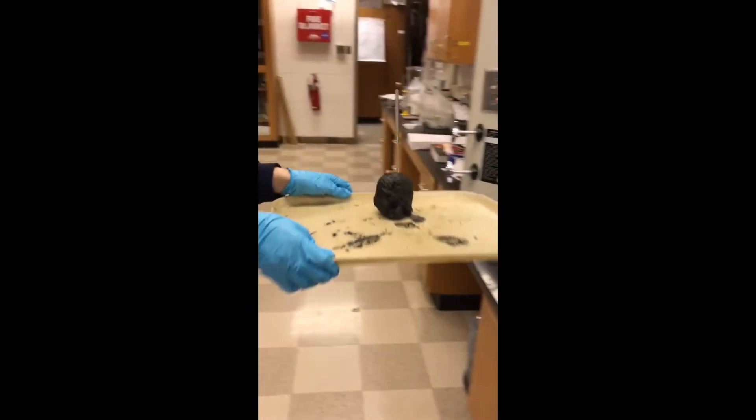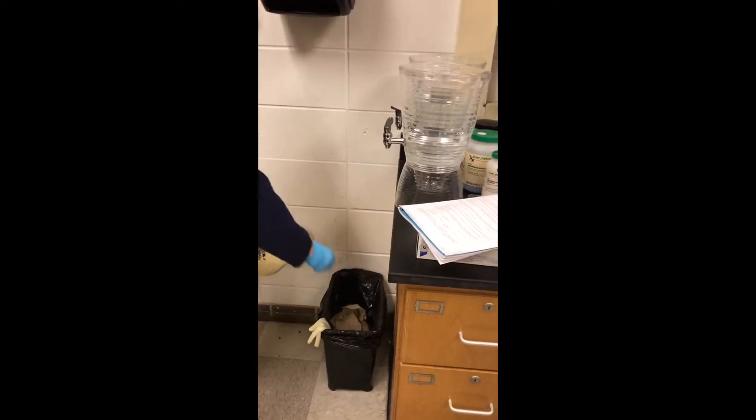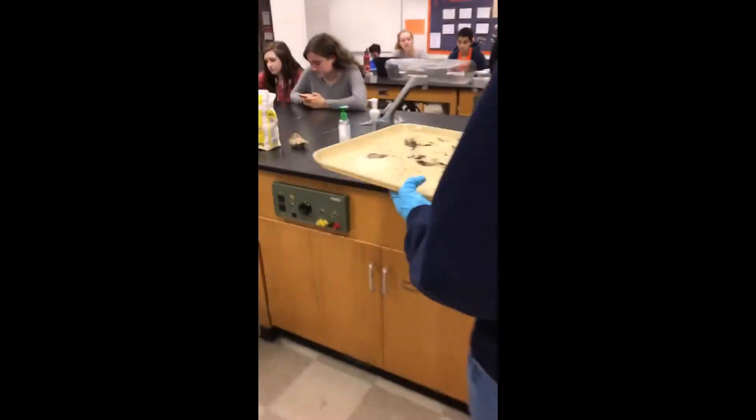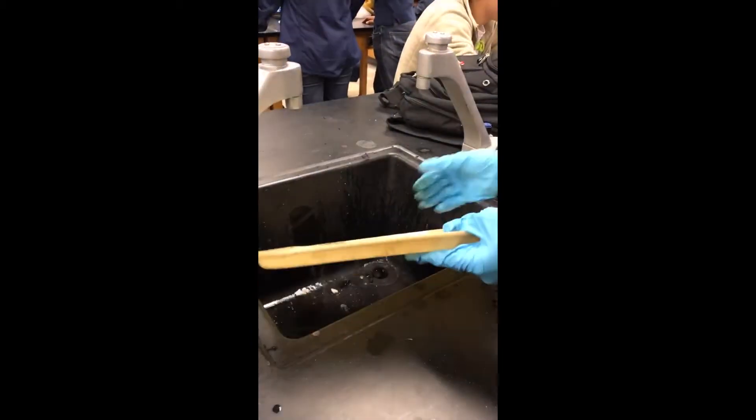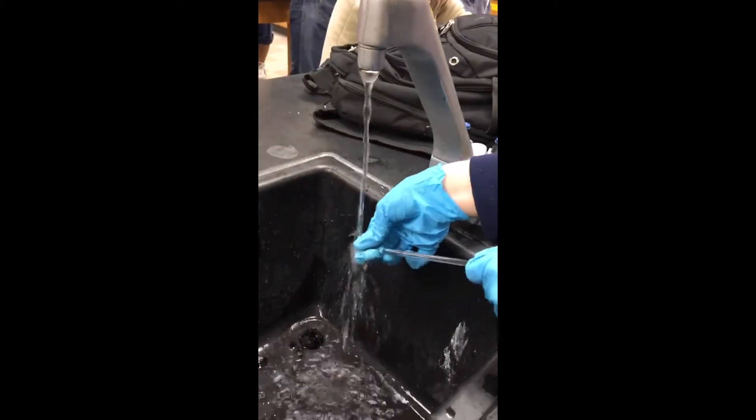Grab the tray on which the reaction occurred and dispose of the Dixie cup in the nearest trash can. Pour a small quantity of soap solution onto the tray and rinse it under the sink. Finally, make sure to clean off the stirring rod.